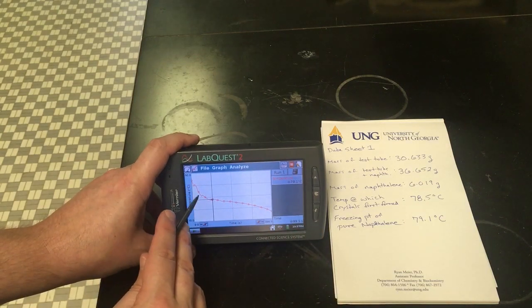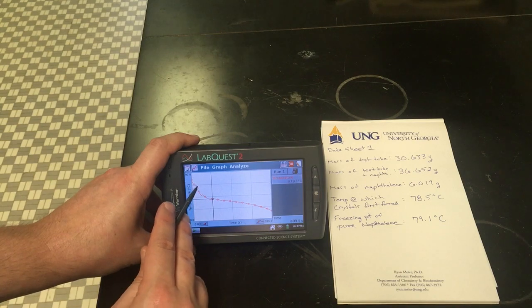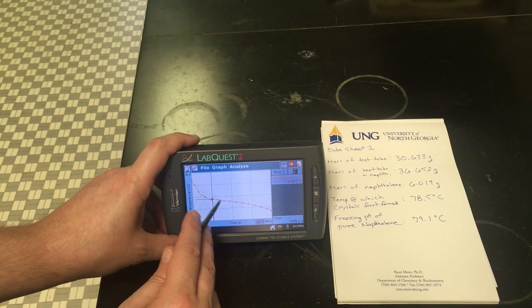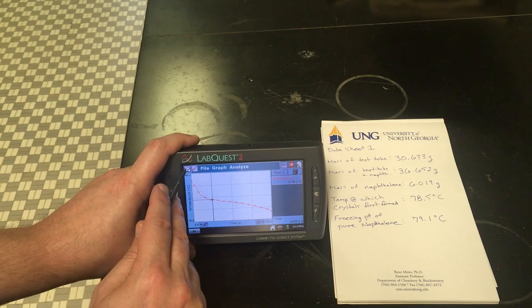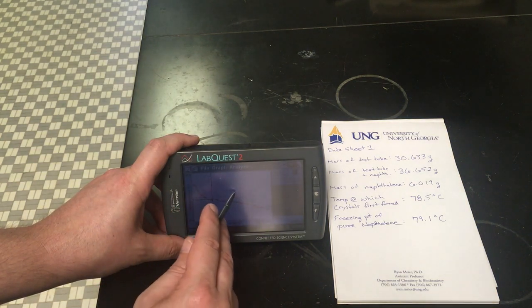If I'm looking at this plot of data, I'm seeing a constant decrease all the way down. There's a couple little aberrations here, but it's still pretty steadily decreasing. And then all of a sudden I get a little tiny spike here, almost more just a plateau, and then it slowly decreases before starting to steeply decrease later on. What I'm looking for here is where the slope of everything really changes, right? It's decreasing pretty rapidly, gets down to here, and then everything flattens out and plateaus.